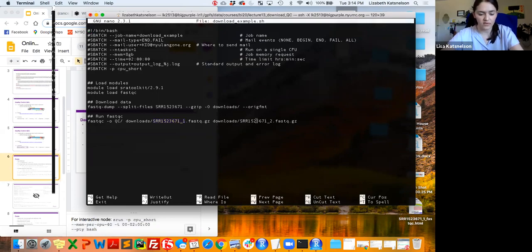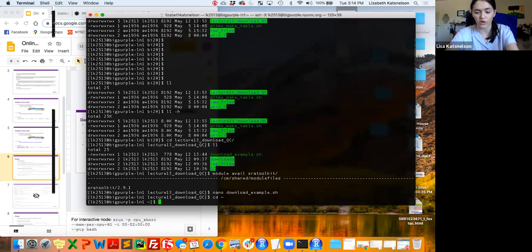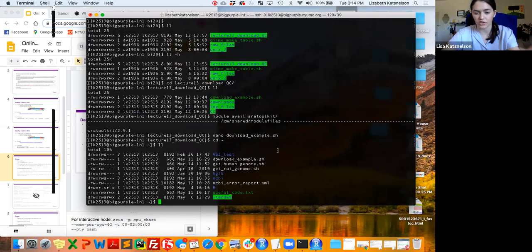So I'm going to exit out of Nano for now. And if you want to copy that file to your home directory, you're going to go back. Let's go back home. So if you do cd tilde, that'll take you to your home directory. So if I go back, these are just my own personal files that I have. If I want to copy that file, I'm going to do cp, give it the path to that file.